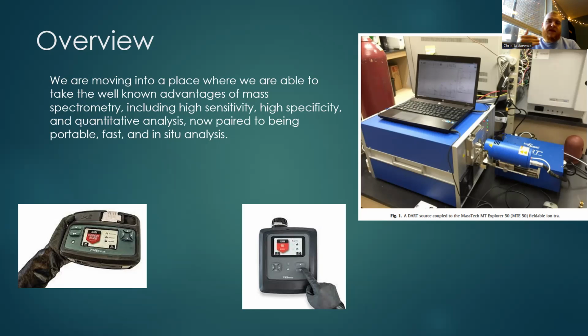So that's one of the main ideas here, because in the past we've definitely had this idea that we can do chemical spot tests in field, which is a colorimetric analysis, which is good qualitative chemistry. However, we're not quite down to the part of quantitative chemistry. With that, it also increases our sensitivity. So with portable mass spec, we're now getting into a trace evidence analysis instead of a more bulk analysis.